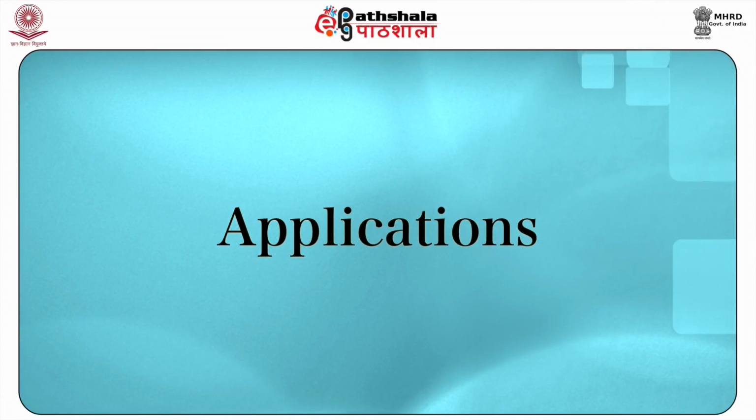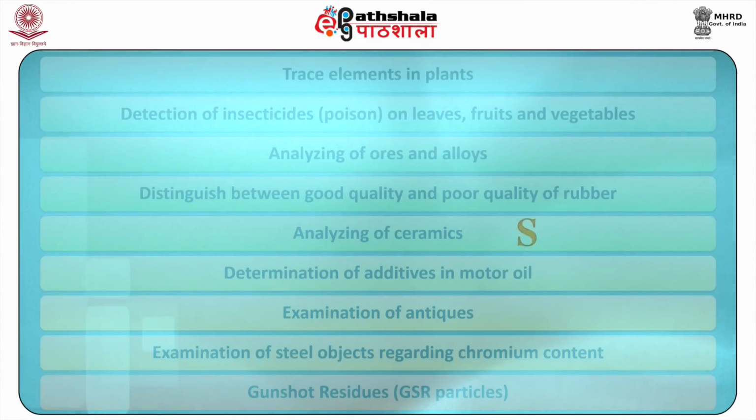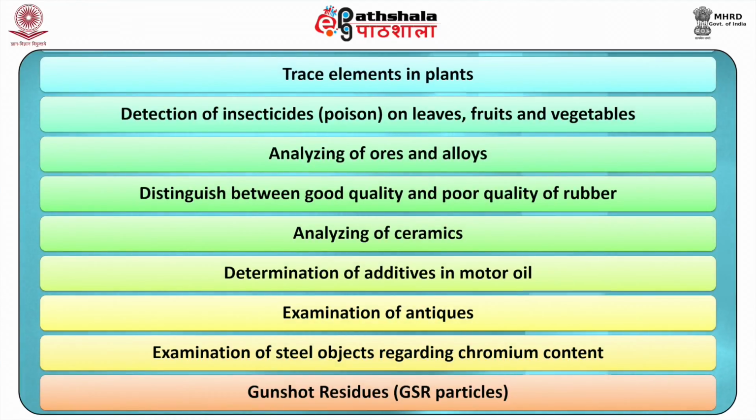Applications. Characterization of soils, trace elements in plants, detection of insecticide poison on leaves, fruits and vegetables, analyzing of ores and alloys, distinguishing between good quality and poor quality rubber on the basis of presence of sulfur, analyzing of ceramics, determination of additives in motor oil, examination of antiques, examination of steel objects regarding chromium content, and gunshot residues, GSR particles.